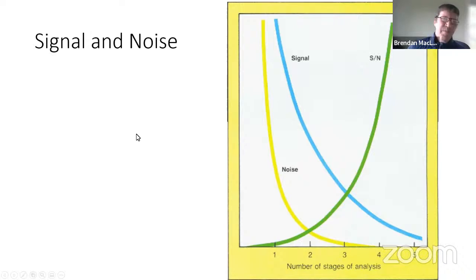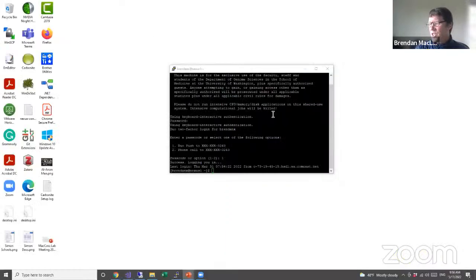So when we've had these discussions about whether we should use sample specific libraries or big wide libraries, and what the priors are, I think everybody can agree that if all I'm doing is adding peptides that are not changing, I'm actually making my life worse. So the more I can know up front, and the more I can increase my signal and reduce my noise, the better. And sometimes when I just go with bigger and bigger data sets, I'm really just adding a lot of noise. And with that, I will turn things over to Mina to dive into the details of those data sets we just talked about.